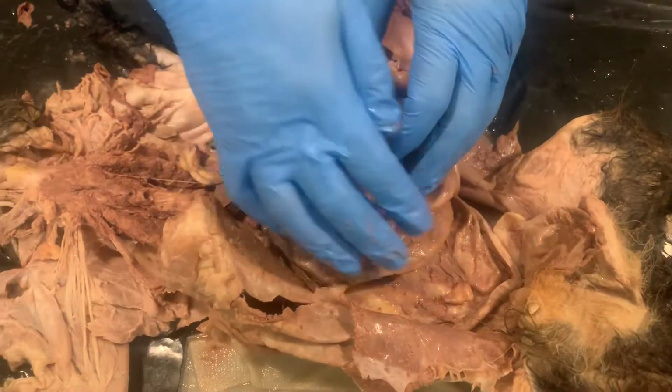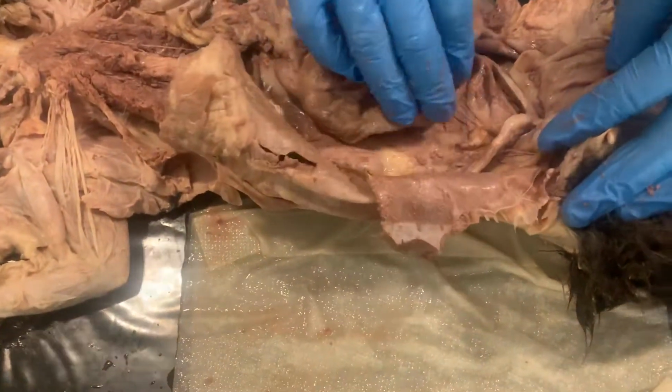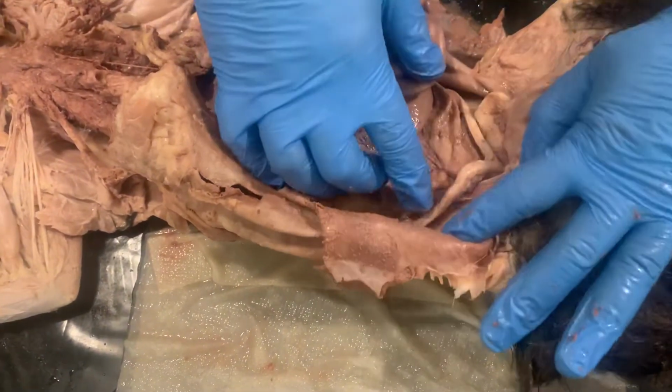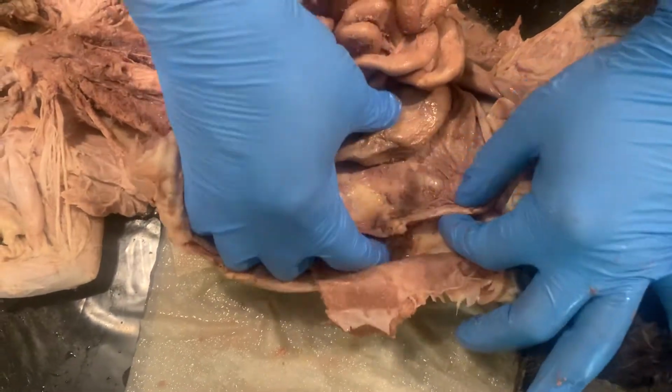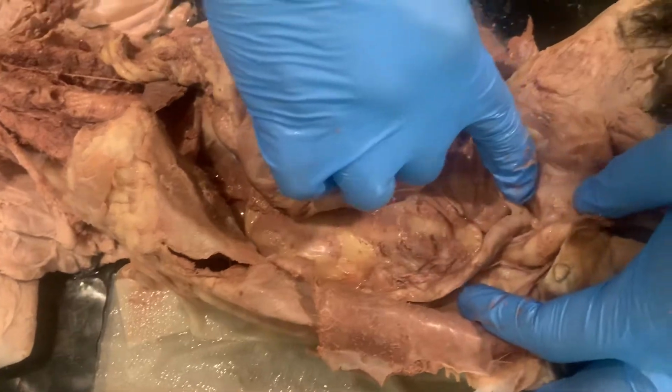Okay, now this is a female. You know it's a female because after I pull the bladder up out of the way, you have fallopian tubes and ovaries. There's an ovary, fallopian tube, and then down into the uterus.